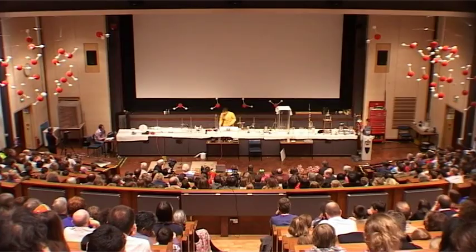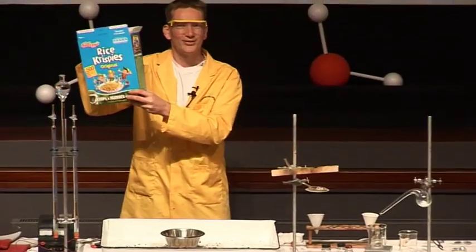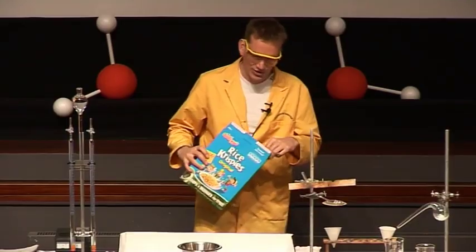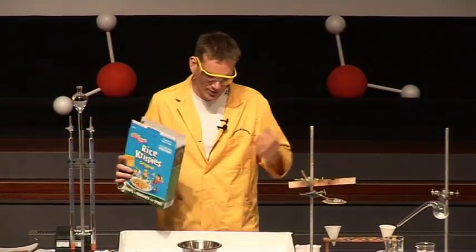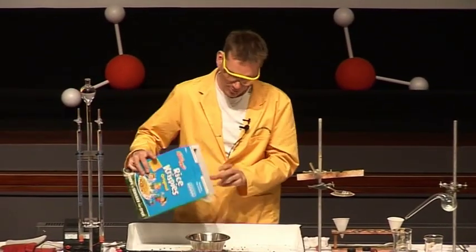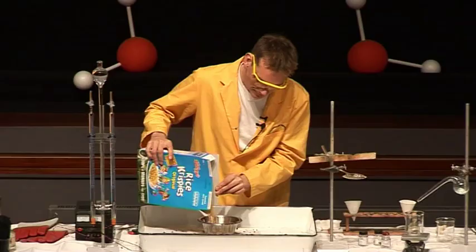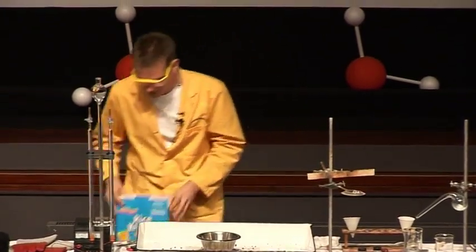I have one more demonstration to show you, started by a drop of water. This is with some Rice Krispies. Now, if any of you have seen some of my other lectures, you may have seen when I'm reacting Rice Krispies with oxygen in the form of liquid oxygen. And then we light it with a stick, and the Rice Krispies go up quite drastically. Well, this lecture, of course, is all about water. So I'm going to start this reaction with a drop of water.